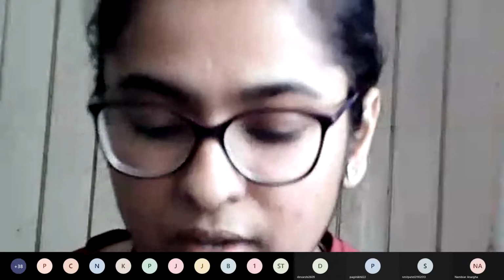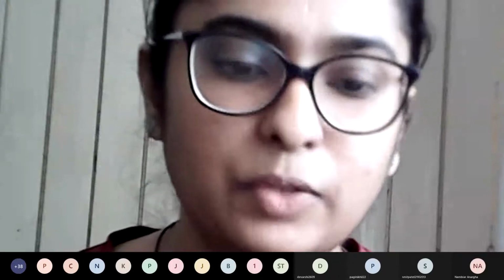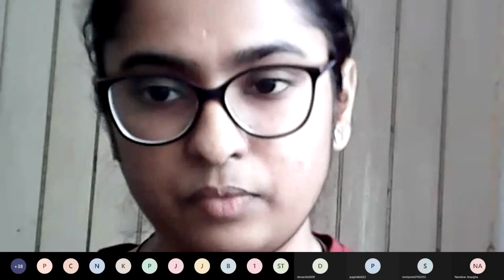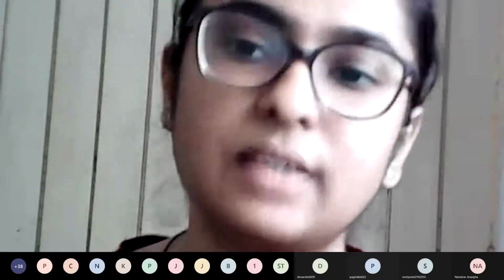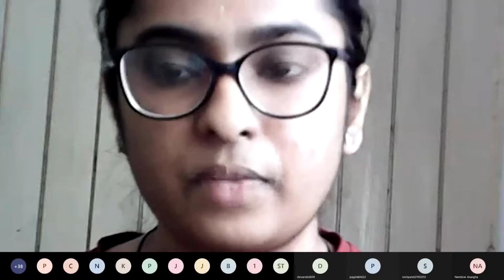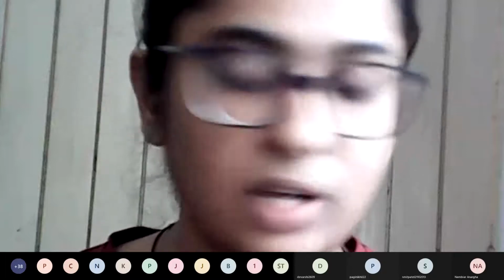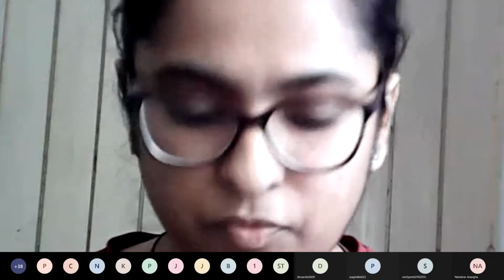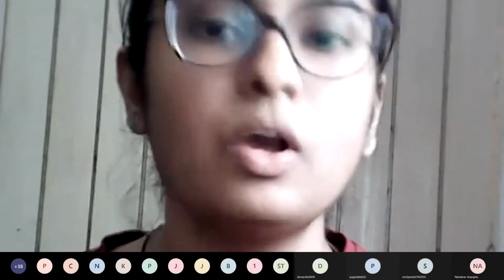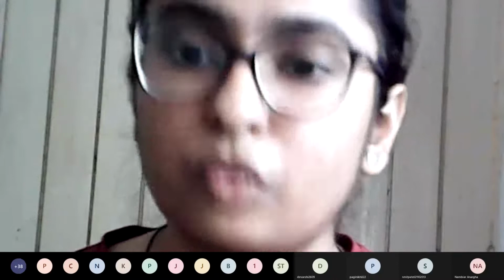Now, one more important step that I have to tell you is what is with the color change. What is happening and why this color change. So let me again go back to step 1. So this one that I explained right now for the color change of red to yellow, जब आप ये practical perform करते हो, that is exclusively for zinc.